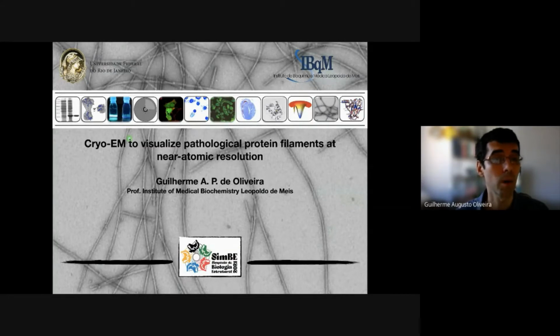Today I'm going to talk about Cryo-EM and how we can use general transmission electron microscopy to visualize pathological protein filaments at near atomic resolution and with an unprecedented level of detail.